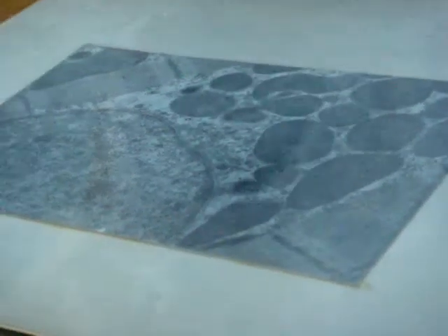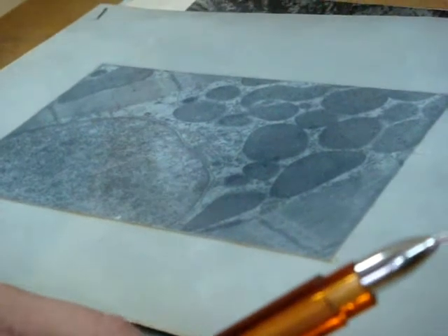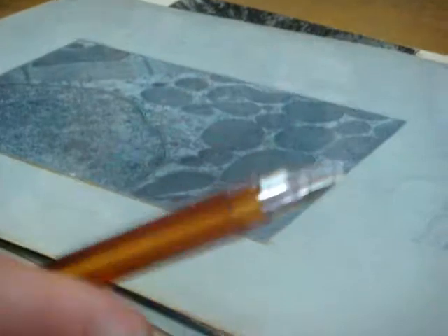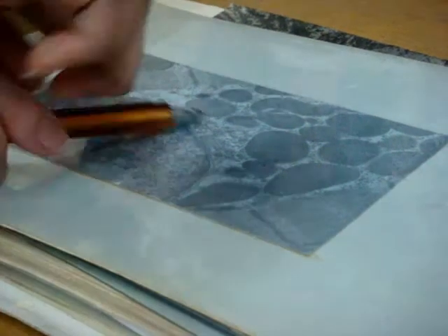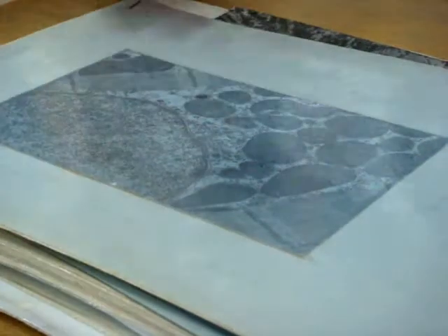Also, we remember that we subdivide muscle tissue into skeletal, cardiac and smooth. Because it's striated, it may be skeletal or cardiac. Do we have some information to determine skeletal or cardiac? Yes. Why? Because of the position of the nucleus in the center. So this is cardiac. That's all.